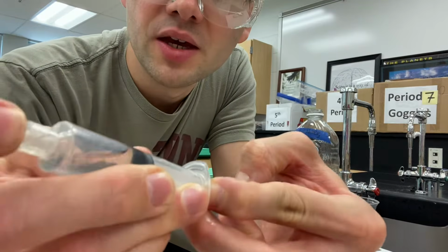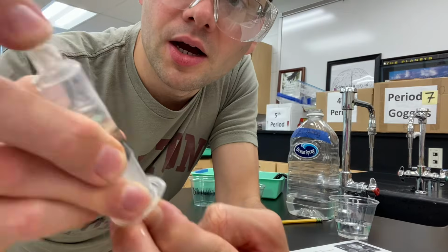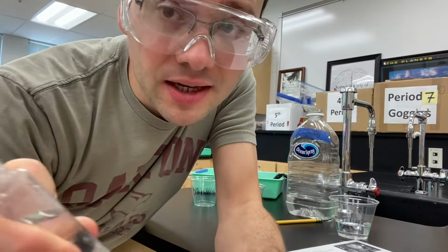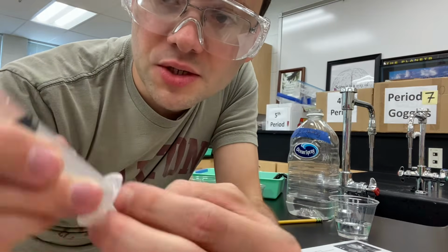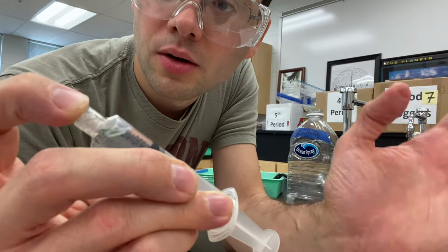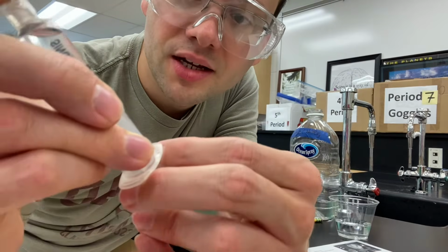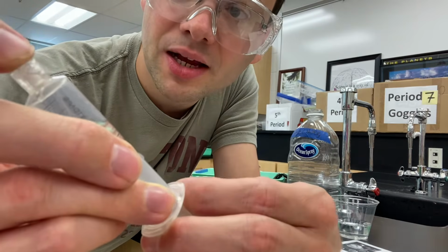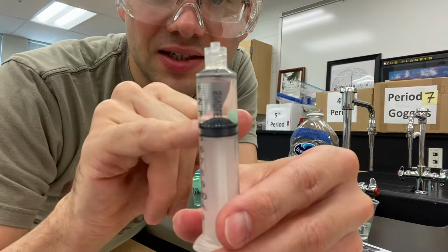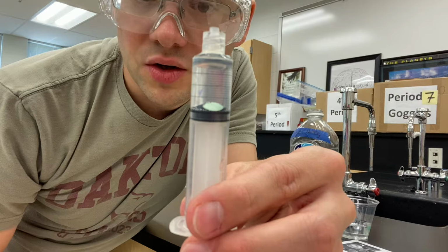It's not gonna wanna actually pull back nice and easy. So you've kind of gotta put some effort into it, shake it a little bit, maybe jostle it around, and that will kind of suck the air out of the spongy mesophyll, and it will replace it with the bicarbonate solution. So you might have to do that a couple times. You can let go of the syringe every now and then to kind of reset and start again if some discs are not sinking. But the basic idea is that you've got to get the discs to sink, and you can see it's sunk to the bottom of my syringe.